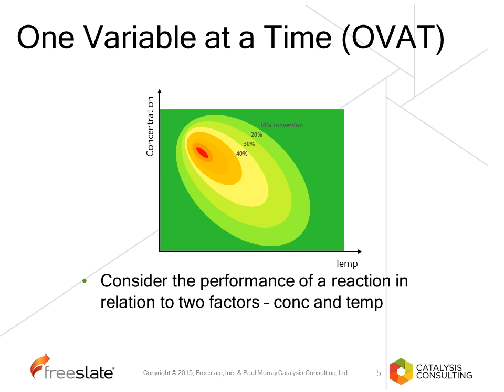So experimental design is a different technique and is different to how people are traditionally trained. When you study chemistry, you learn to change things one variable at a time. So what does this mean?